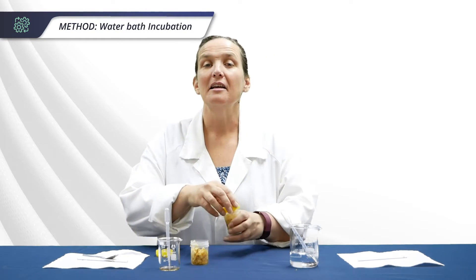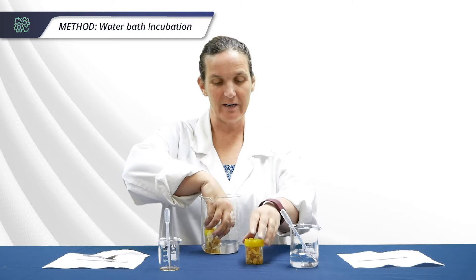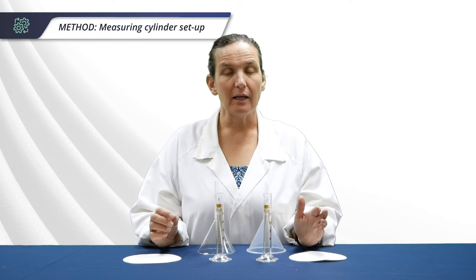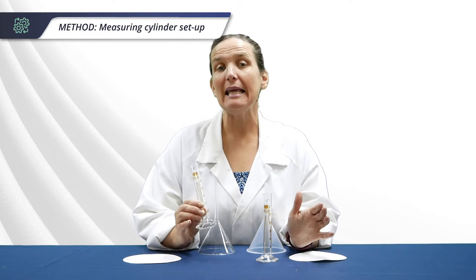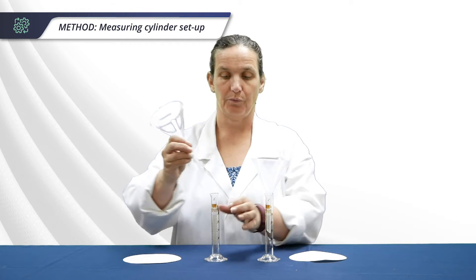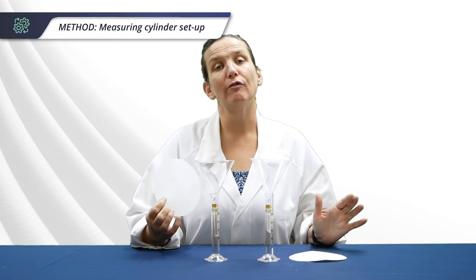Once you've done that, put the lids on and pop them into a water bath for 15 minutes at 40 degrees. While your samples are incubating, set up your measuring cylinders — mark one E for experiment and one C for control — and place the funnels into the measuring cylinders. Then fold the filter paper to fit into the funnels.